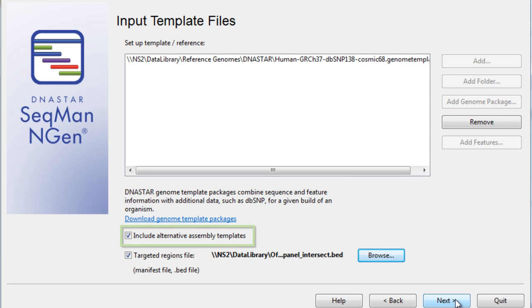I'll also check the Include Alternative Assembly Templates box, as this will include alternate sequence representation for variant regions.